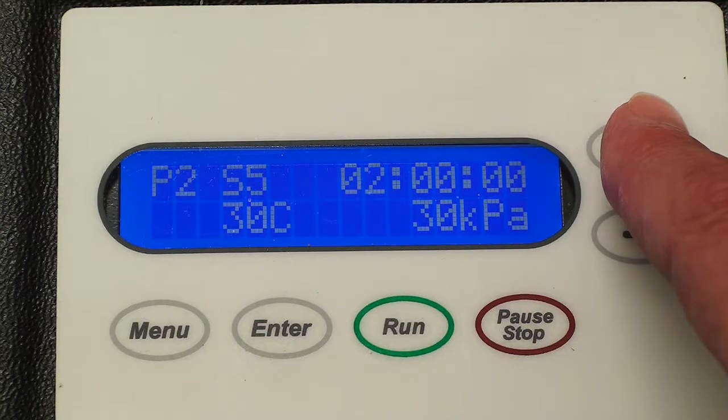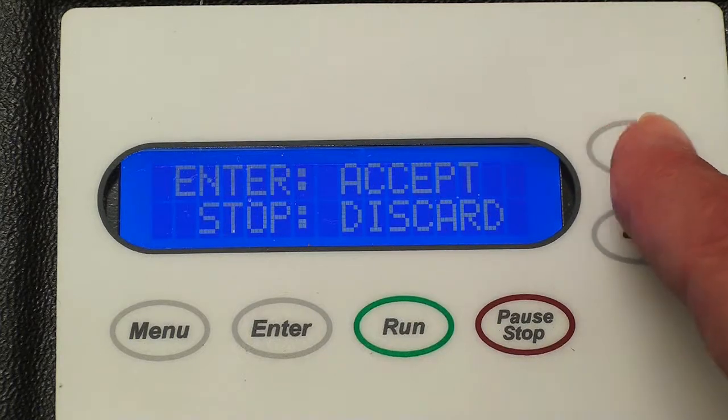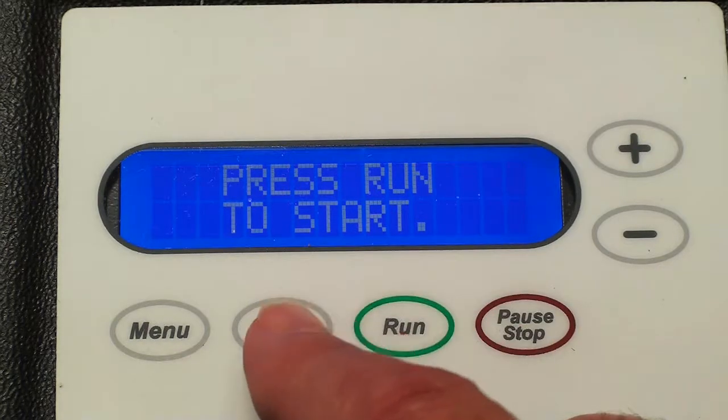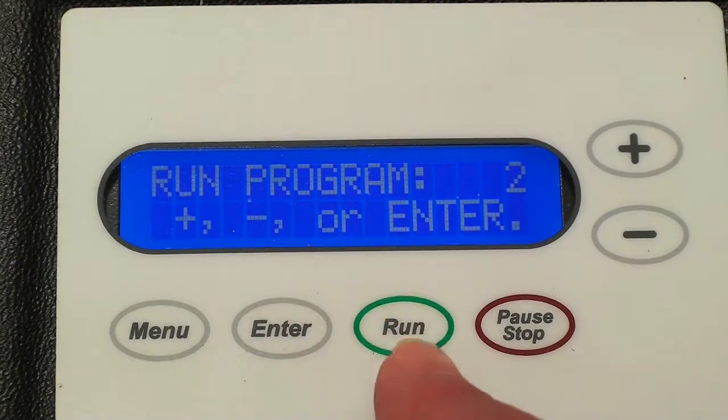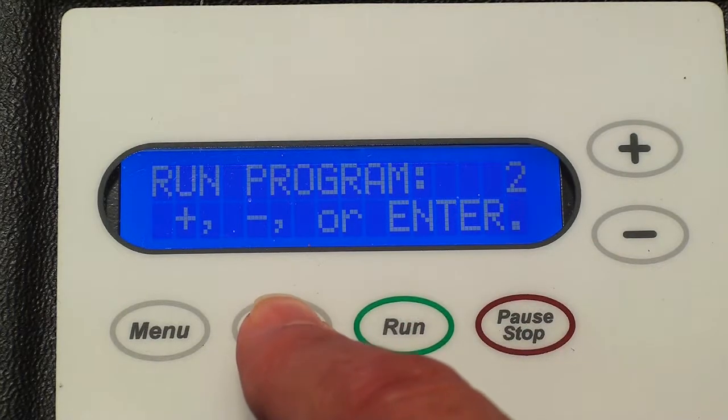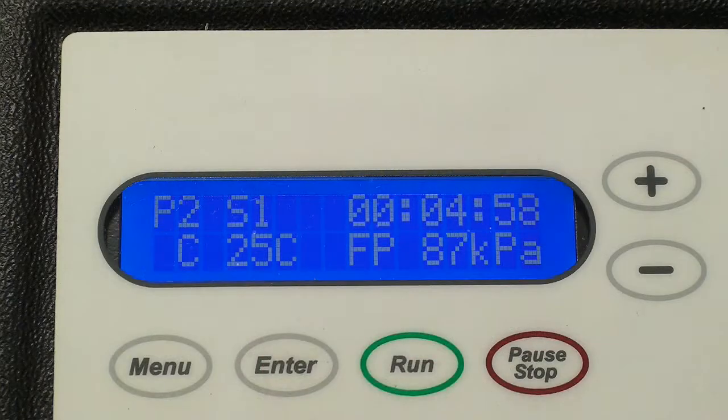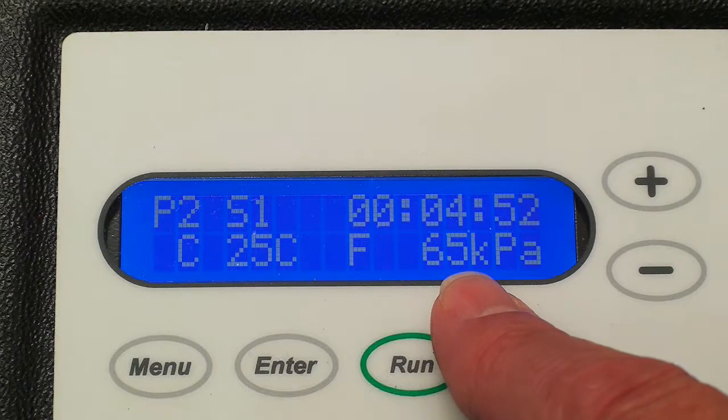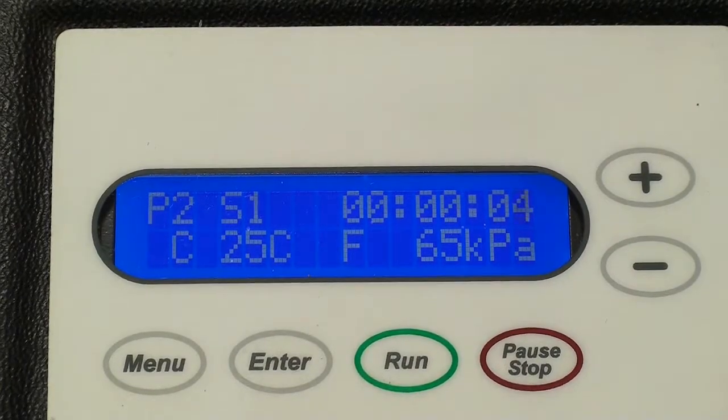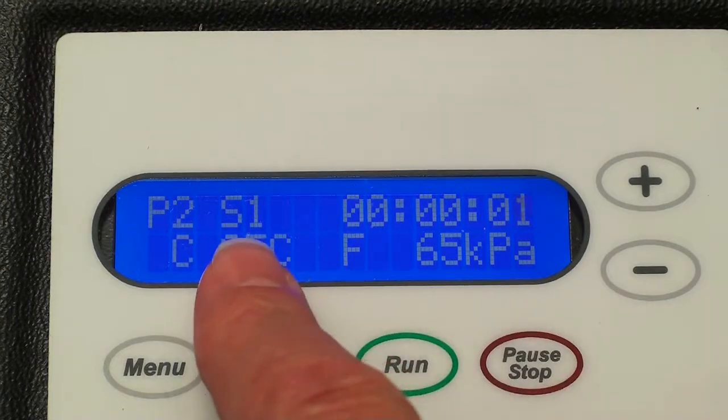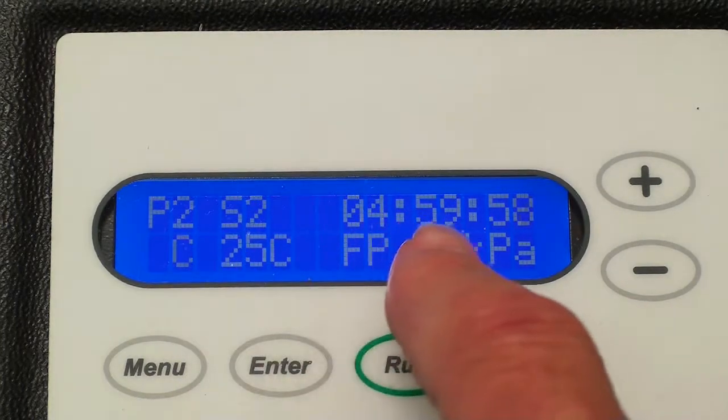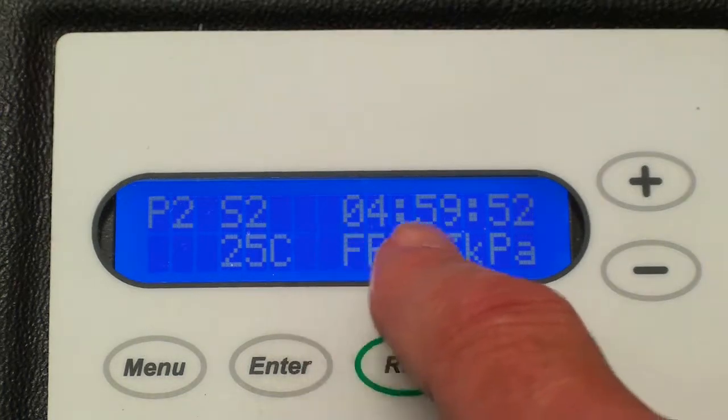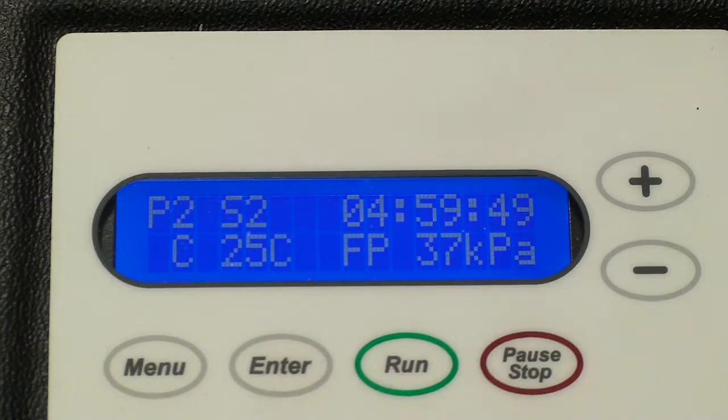Now between steps 3, 4, and 5 there is a 6 hour flush. Now here I'm accepting that and that looks good and so I've got my samples in that I'm ready to go and the last thing I have to do is push enter. And we're going to see that it starts to pump down from the 97 kilopascals. It's going to pump down, the temperature is correct and our time is already going. And now it's gone from step 1, and now it's going to go to step 2, and we can see now it's 5 hours that it's going to be due, 25 degrees centigrade, and it's going to pump down now to the 35 kilopascals that I wanted.